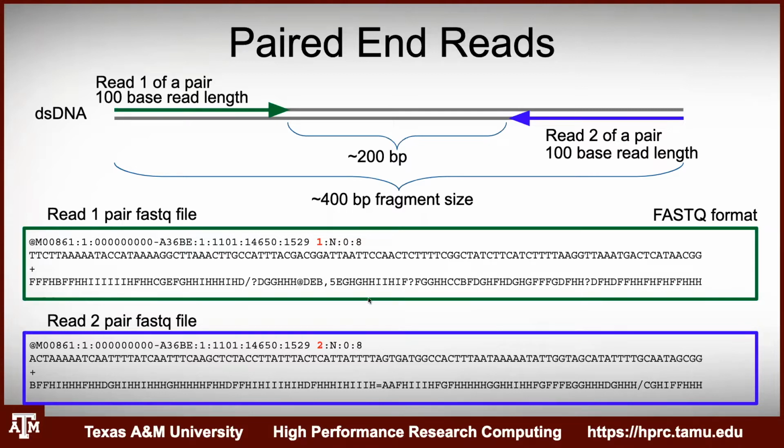These represent Phred-based scores. For example, I think F is a quality score of 37 or something like that. The way these scores work, a quality score of 30 means the probability of it being an error is 1 in 1,000. A quality score of 40 has an error rate of 1 in 10,000. All right, so any questions on that?